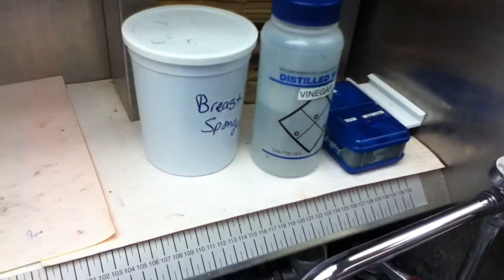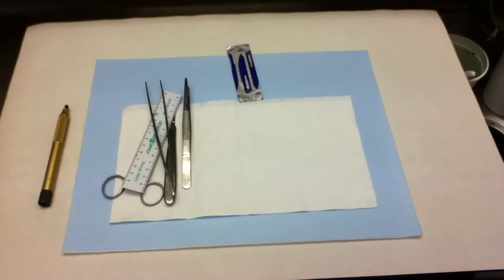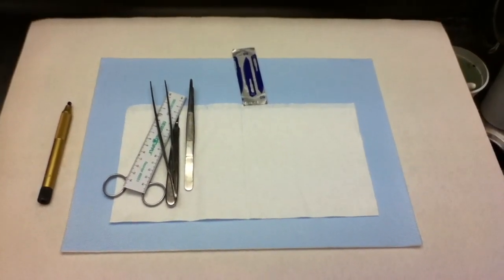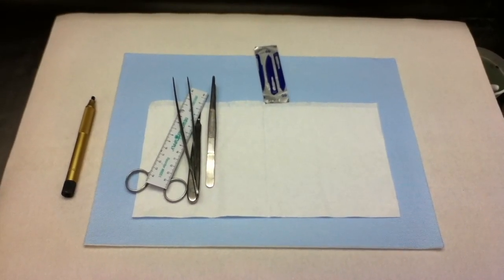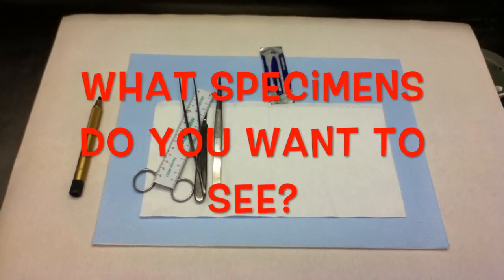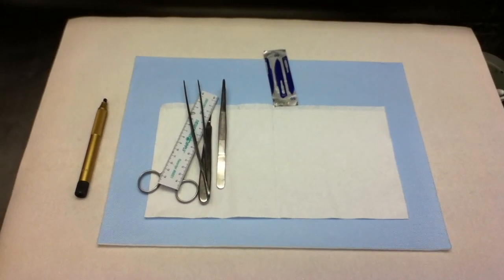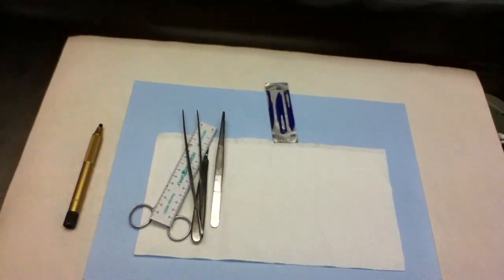I have a little squirt bottle with vinegar for fixing my inks, and a paper towel holder. That's basically the grossing bay setup. I want to get back into shooting more videos — if anyone has ideas for specimens they want to see grossed, add them to the comments and I'll do my best to accommodate. I don't get a ton of different specimen types here, but if I do get one I'll shoot a video of it.